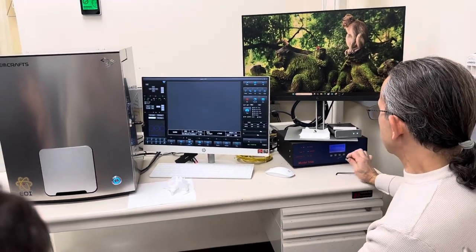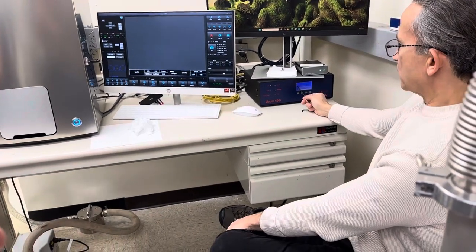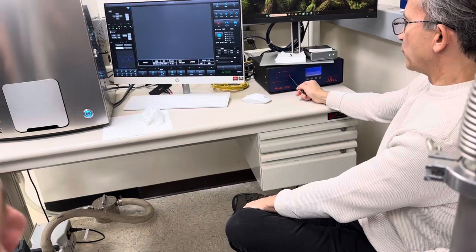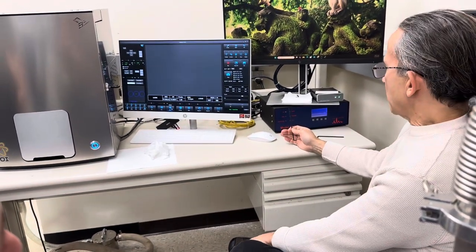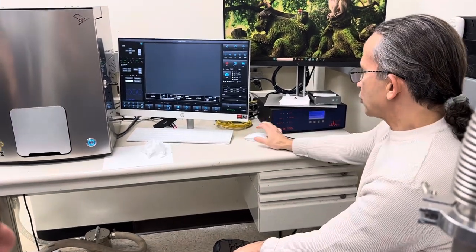one thing you'll notice is this meter right here went down to almost 0. See that? And so my rate and my preamp are still blinking because it's looking for information. So it's ramping, but this scale right now is showing nothing.